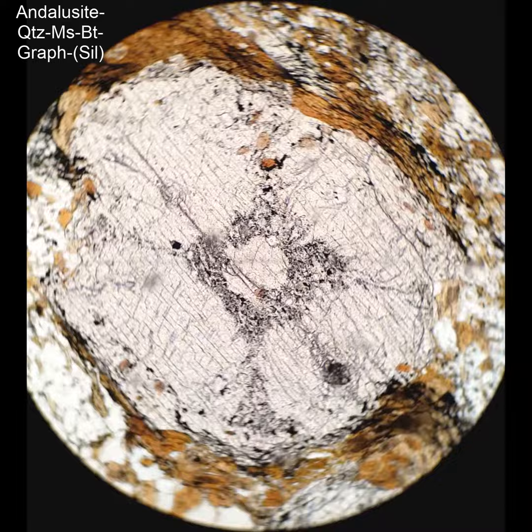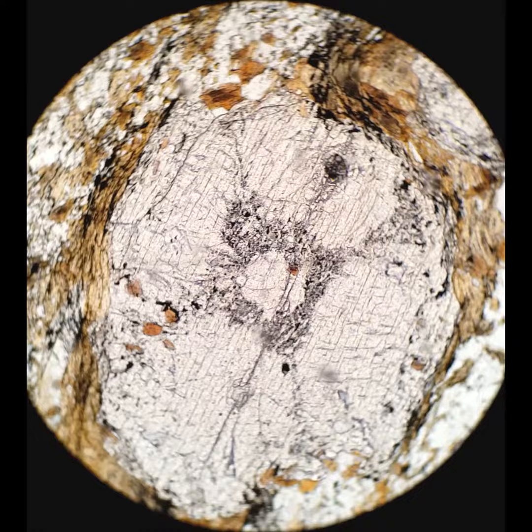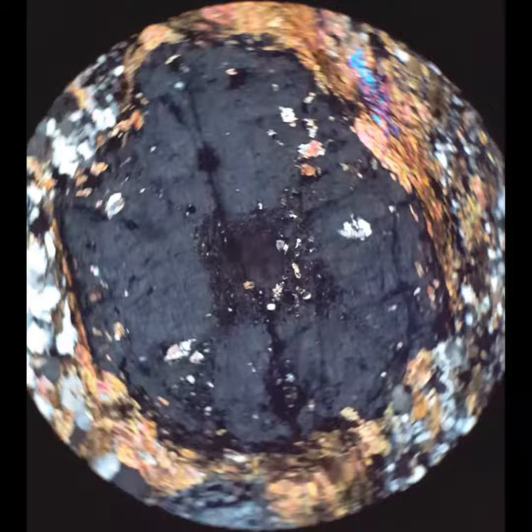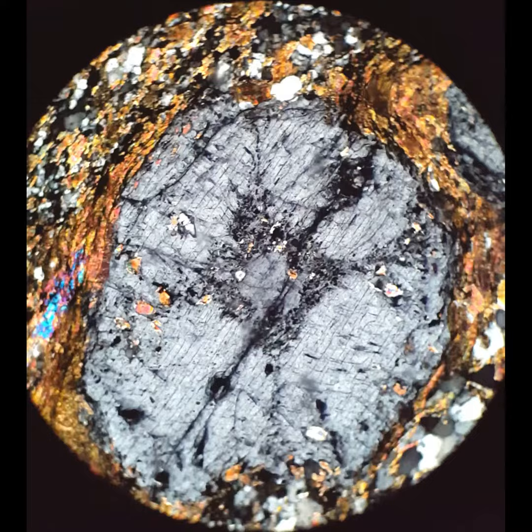I couldn't really resist — it's another chiastelite. There might be a very slight pink pleochroism in the core; it was a little hard to tell. But again, this is just so characteristic of prismatic andalusite. If you get a chance, you should look at the sillimanite video tutorial, because it's got sillimanite after andalusite, and you can see that chiastelite structure now converted to sillimanite subgrains.